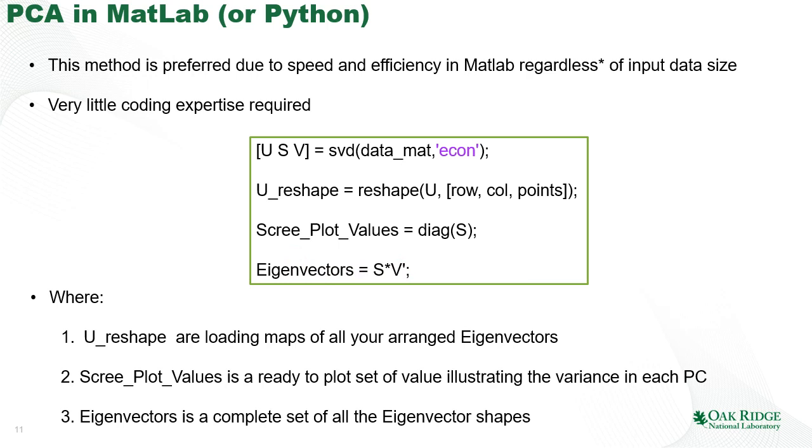So very, very simple. Practically, of course, you really need to play with the MATLAB or Python code to figure out how the dimensionalities are transformed, how to plot the data, and so on. It requires some coding experience, but it's really pretty simple. It takes about half a day to start with your favorite data set, and most of the time will be spent learning how to transform it from the initial file format into something that MATLAB or Python can work with.